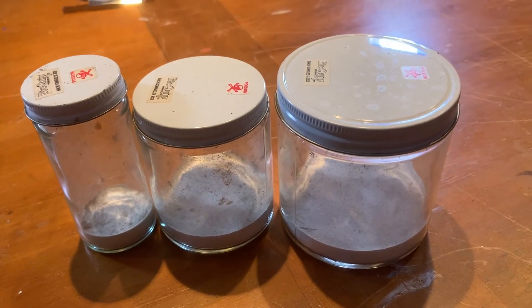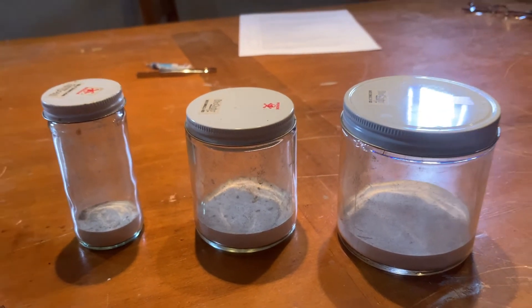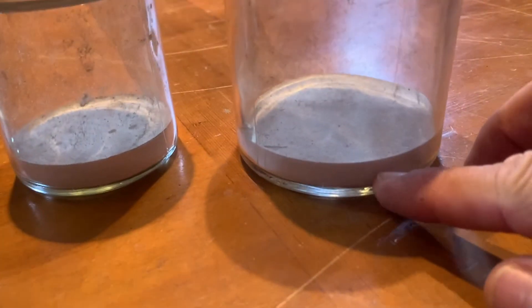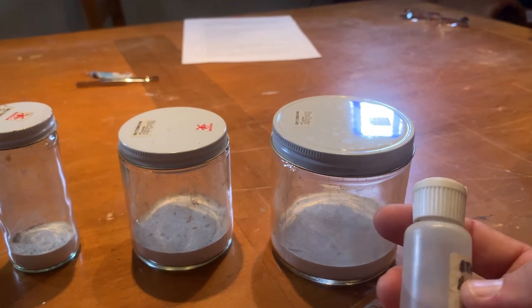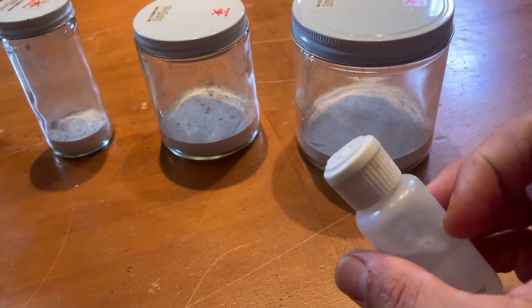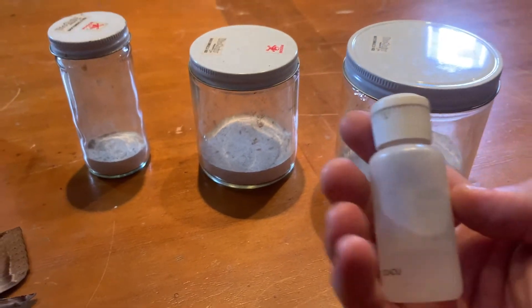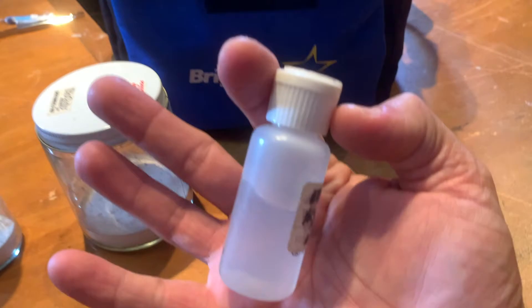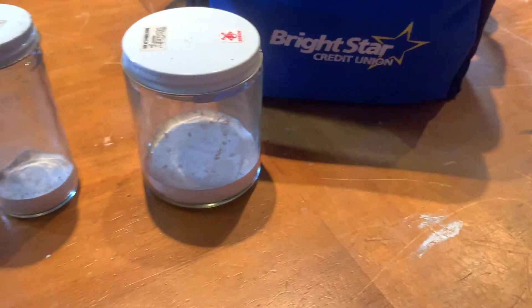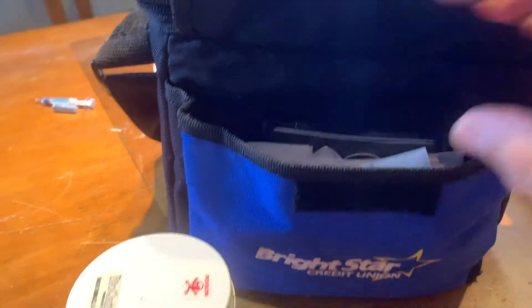The most common way to euthanize a butterfly, moth, or insect specimen is with a kill jar. There are several killing agents people use — some use cyanide crystals, but that's difficult to obtain and very dangerous to have in the house. One thing we very commonly use is ethyl acetate, a type of alcohol available from BioQuip Products. When carrying kill jars, I have a caddy with jars of varying sizes, a small bottle of ethyl acetate, forceps, and envelopes to properly store specimens without messing them up.